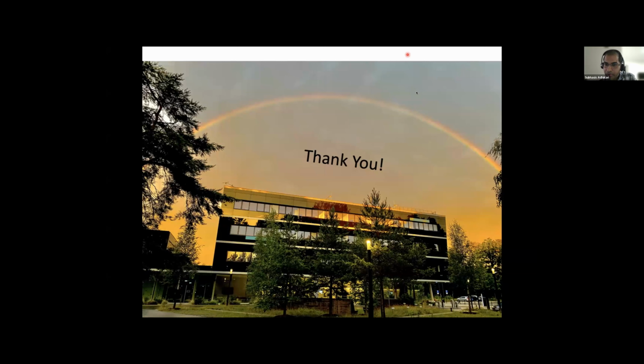Okay, question from Paulo. Nice talk. Can you comment on the requirement of the distance between the object of interest and the cover slip, providing the reflected reference in confocal iSCAT? In other words, how deep can you image?